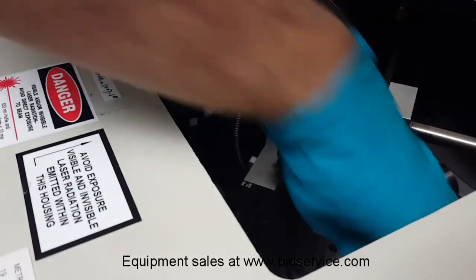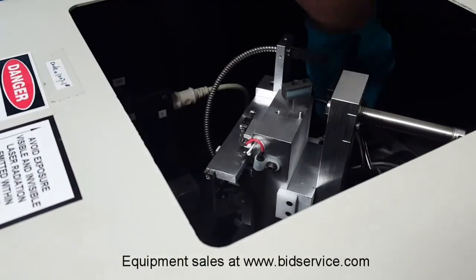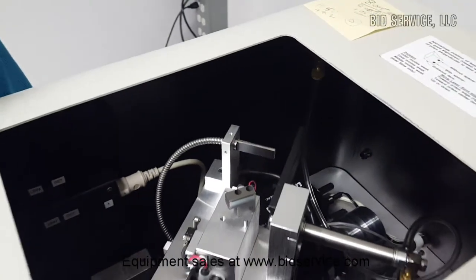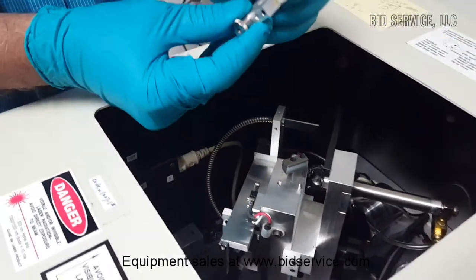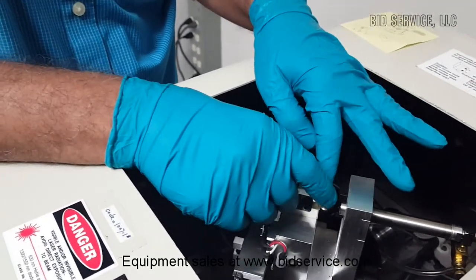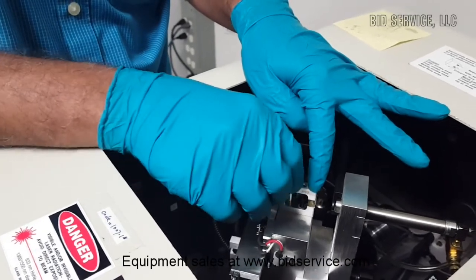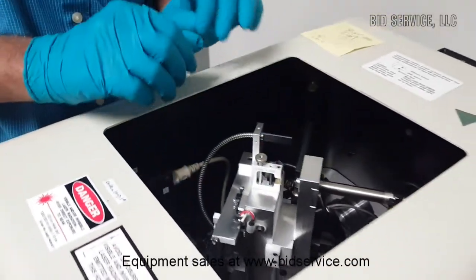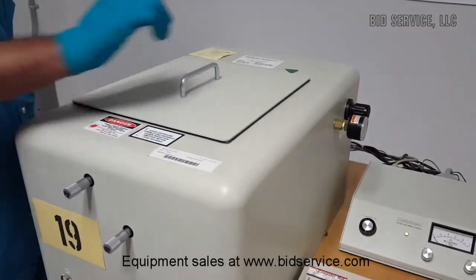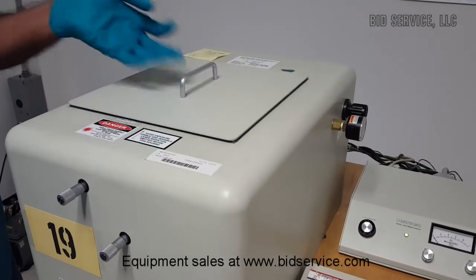The power switches for the lasers, the infrared lasers, are on the modules. You can turn them off. It's a used prism, but it works. This is how we load the prism again and secure it using the thumb screw. It is always safe to remove the sample when the unit is not being used.